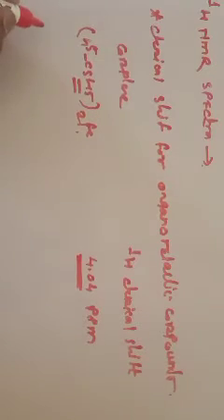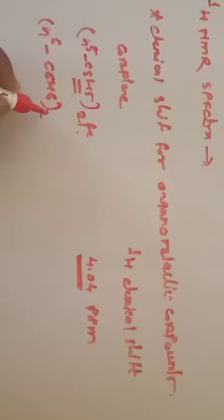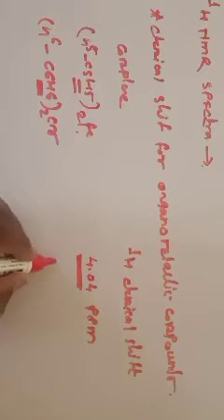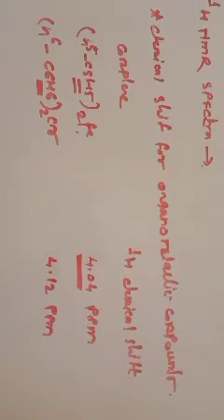Again, if you consider the next one, that is eta 6 C6H6 twice, it is your chromium complex. And for this hydrogen atom, its value is 4.12 ppm. So we already discussed that for cyclic pi ligands such as eta 5 Cp and eta 6 C6H6, the values lie between 4 to 7 ppm. So this is the characteristic value.